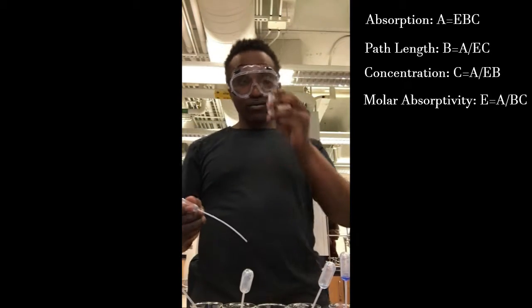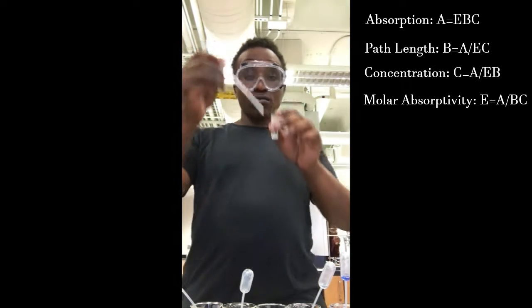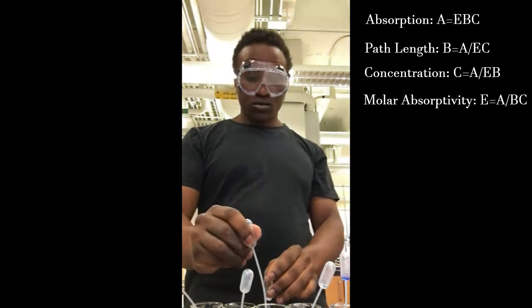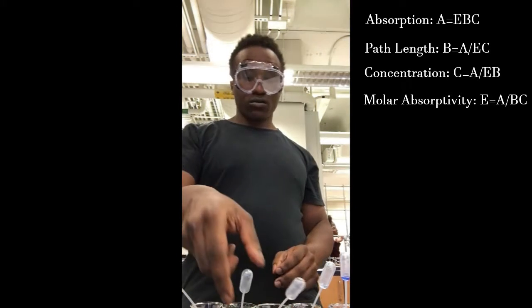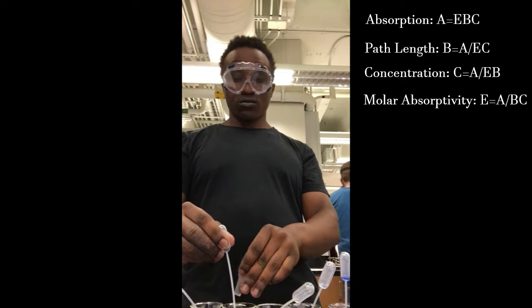This video will serve as an instructional tool in order to find the concentration of an unknown solution. The student in the video has collected several samples from the same stock solution. This will allow the dilutions to be read on a spectrophotometer.